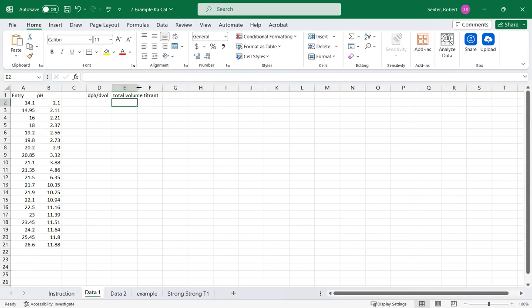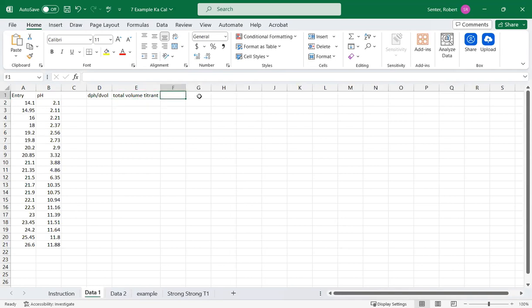And kind of adjust the axis. And so the first thing is just as you're going along, just what is that change in pH? And then what is the change in volume? And now once I do that, then I can calculate by dividing those out. And so here is kind of the classic thing.